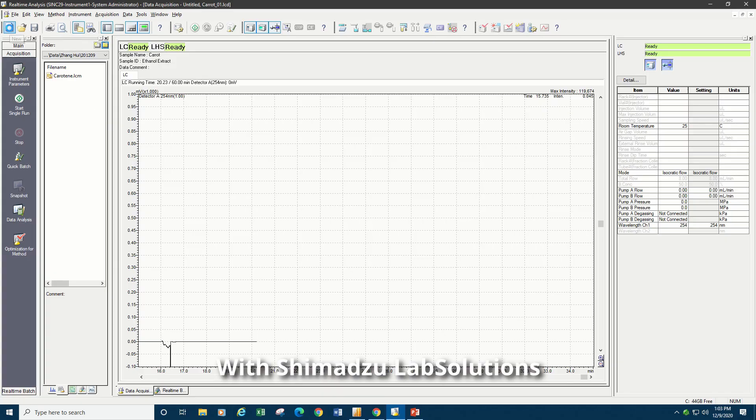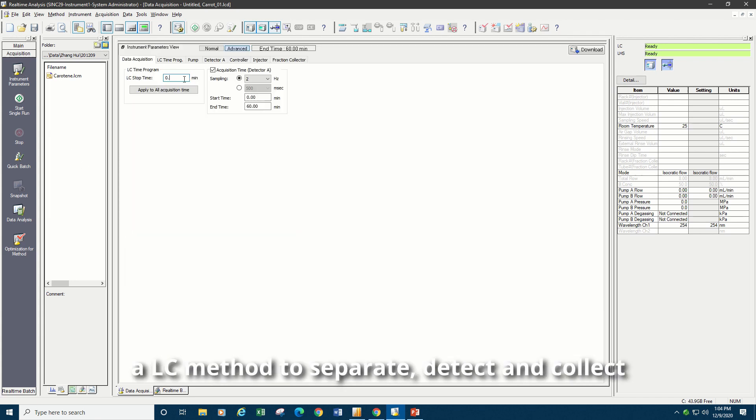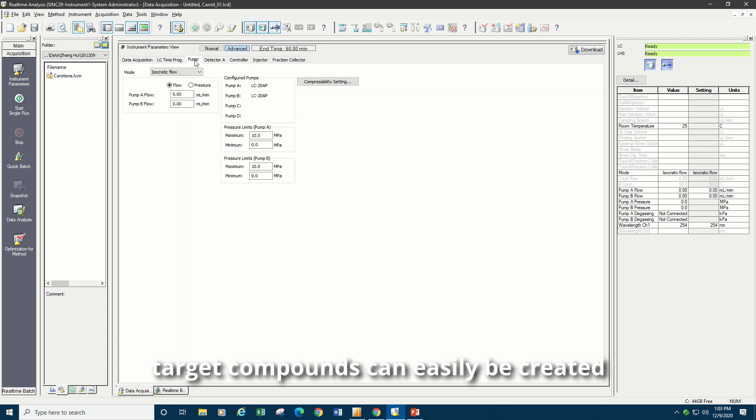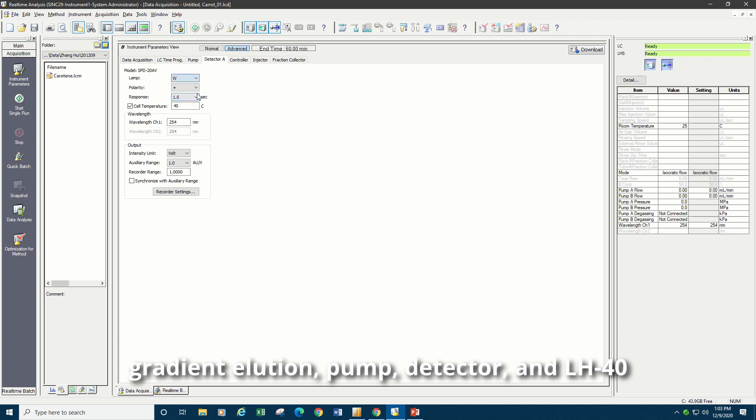With Shimadzu Lab Solutions, a LC method to separate, detect, and collect target compounds can easily be created. The parameters of data acquisition, gradient elution, pump, detector, and LH40 should be set properly to obtain expected results.